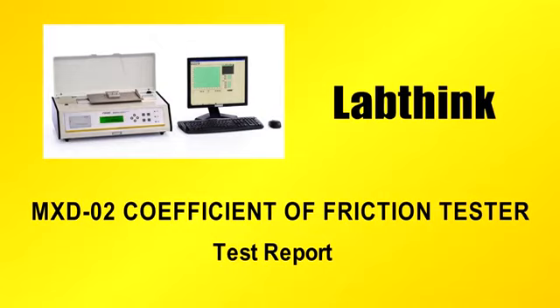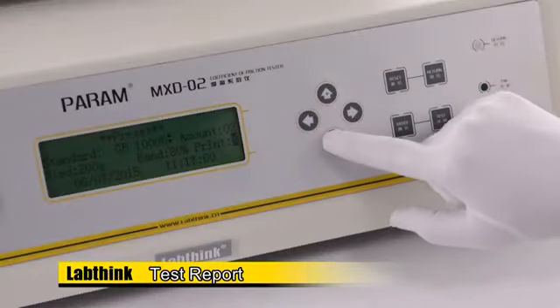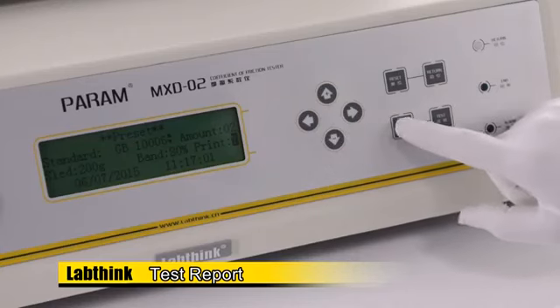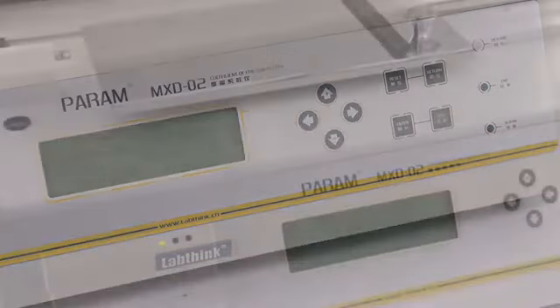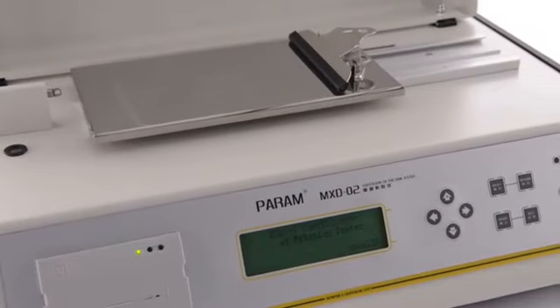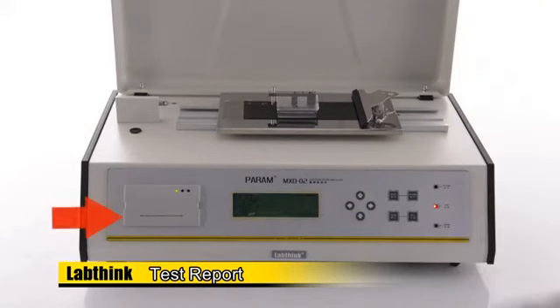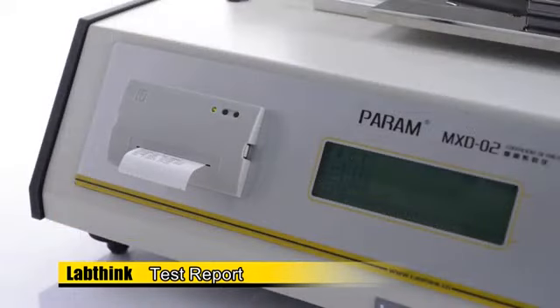Test report. Select Yes for the Print option in the preset interface and press Enter to save the setting. The indicator light for the microprinter will be turned on. When the preset amount of test specimens is reached, the microprinter will print the test report by pressing Task K.